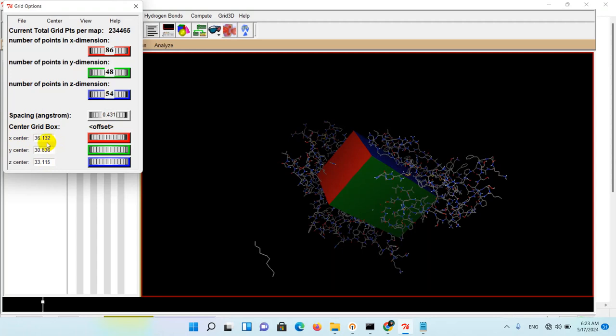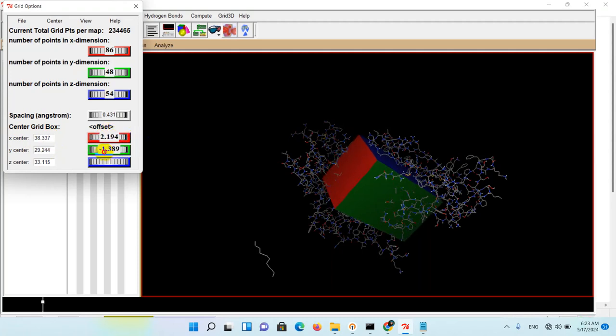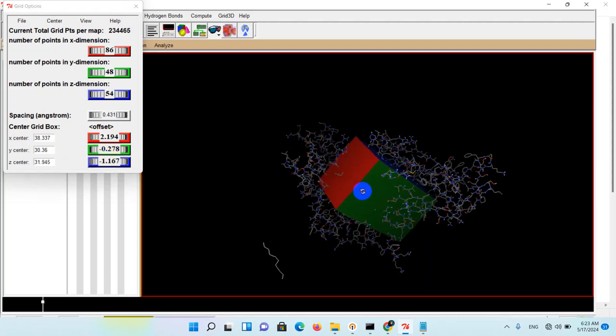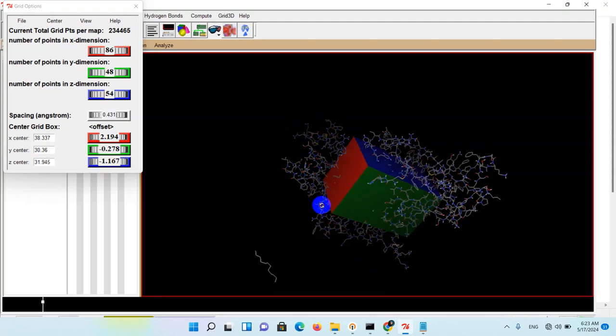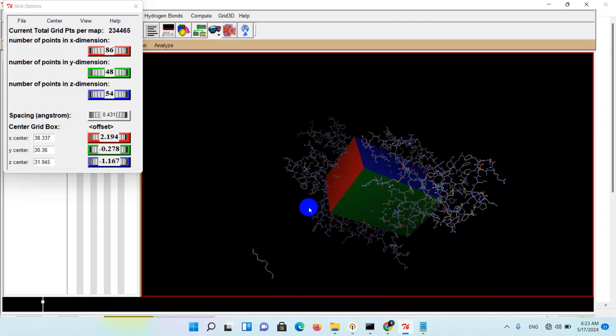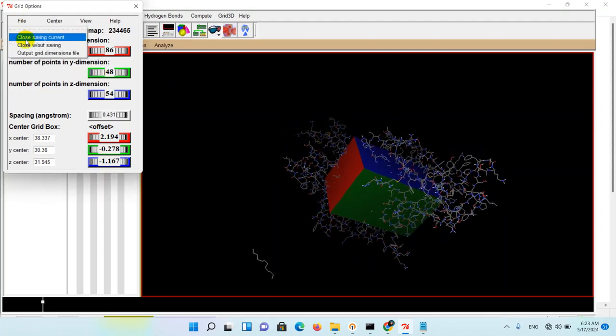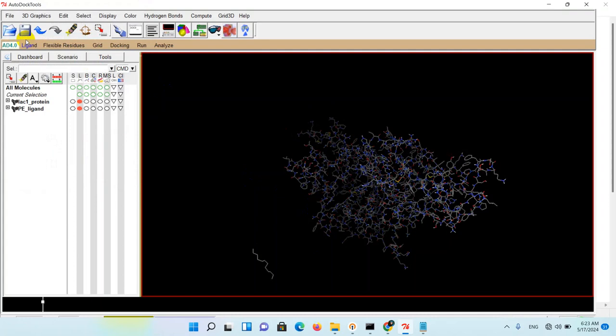For example, if you do this it will change the place. Okay, I think it's good. For example, go to File and close saving current. Now the dimension of your grid box is determined for the software.